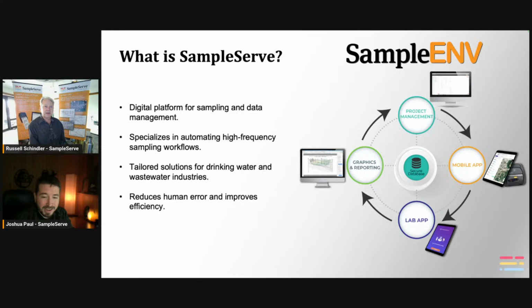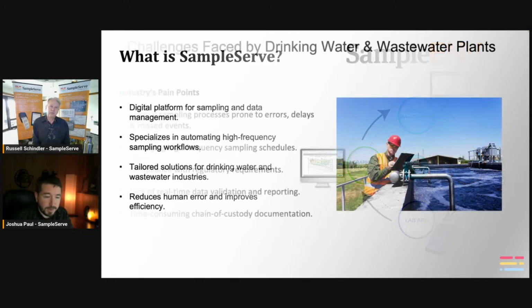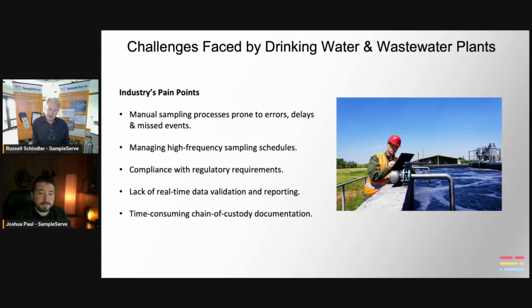Essentially, yeah. And also not even collecting samples, just collecting data. Even if you're just going out in the field and collecting data, this is a really good tool for that. Whether you're doing just collecting data or taking samples, it works both ways, or a combination thereof. Sometimes you have to collect a bunch of data and collect a sample, and it's perfect for that.